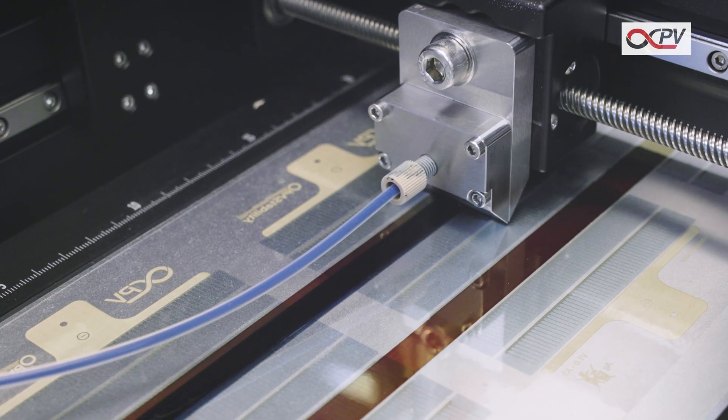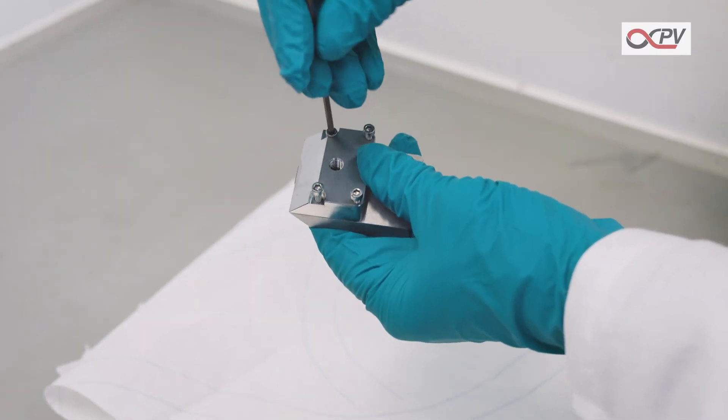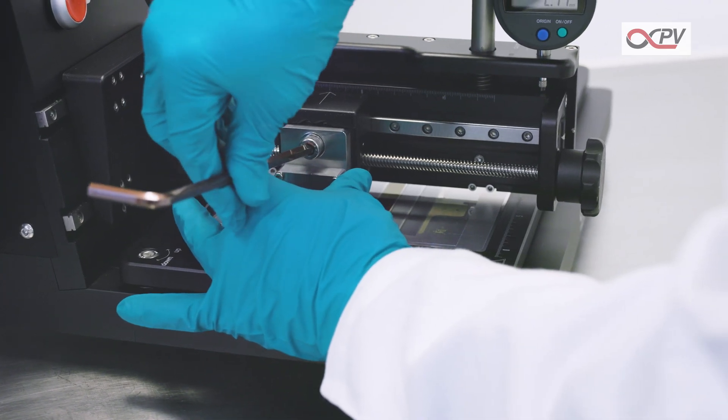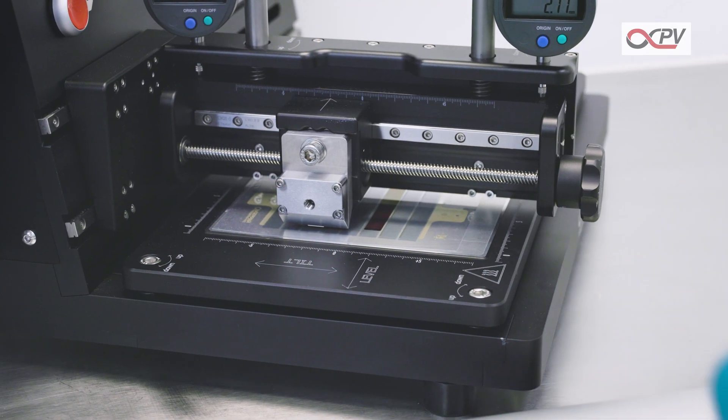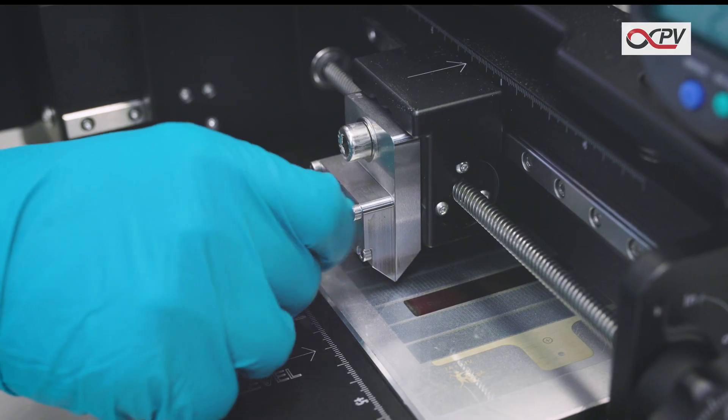Now it's time to apply the hole conducting layer. Start by assembling the Slot Dye Head and mount it onto the Slot Dye Coater. Align its cross-web position with a slight offset relative to the first stripe. Repeat the previous actions to coat a hole conduct layer on top of the active layer.